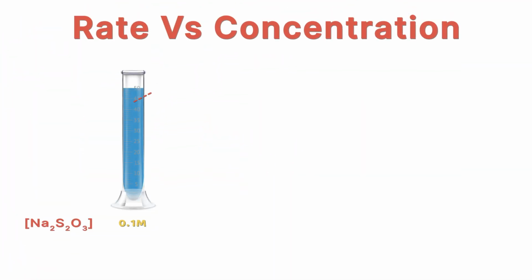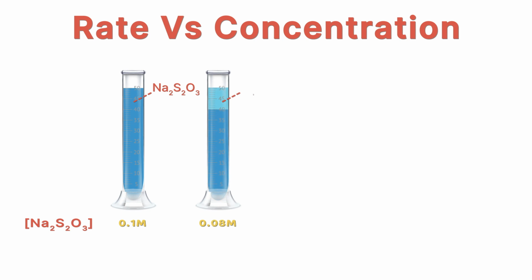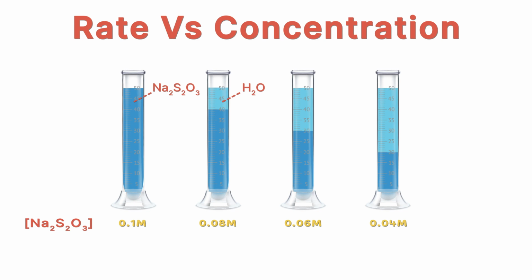Here you will have 5 different concentrations of sodium thiosulfate that you will mix with a constant concentration of HCl. It's very important, however, to understand how these thiosulfate solutions are prepared, as it's very often asked in the exam.